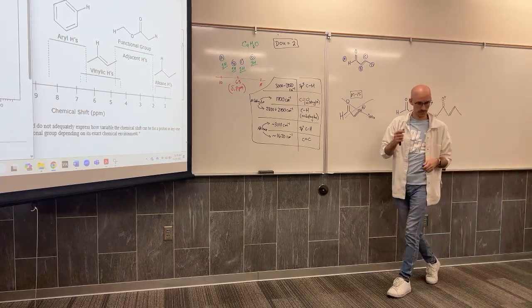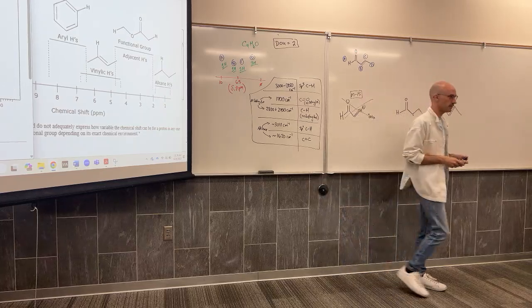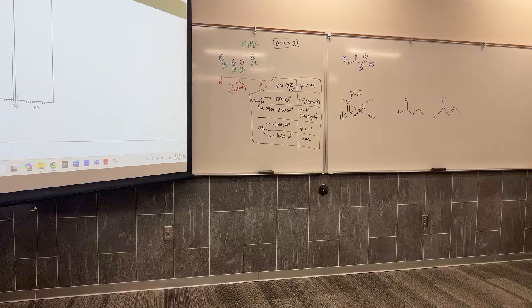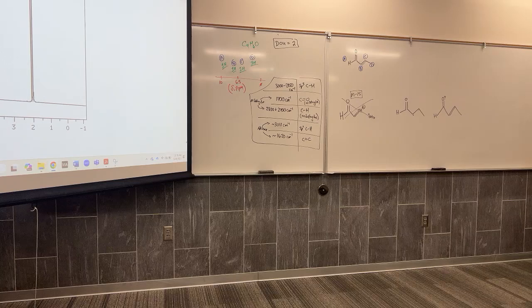I just wanted to go with the NMR on there again. The 2 hydrogens, the 2 sp2 hydrogens that are bonded to the double bonding carbons. The vinylic hydrogens. Yep. They have way more peaks than you'd expect. Is that totally just an artifact?